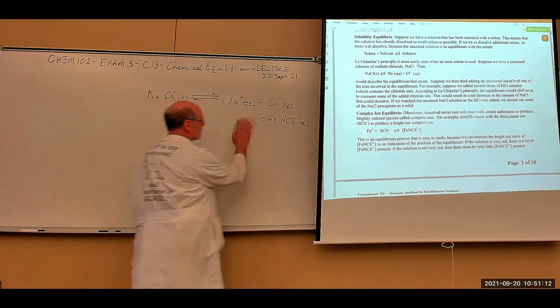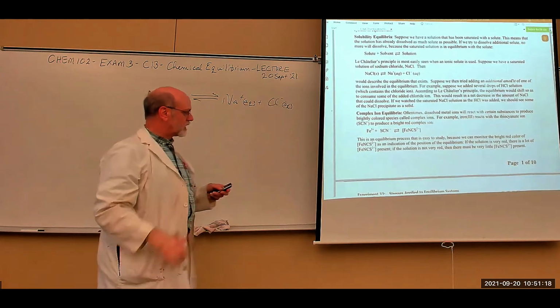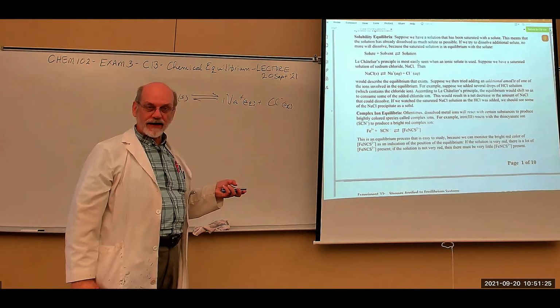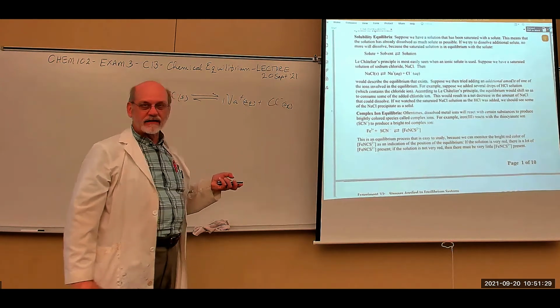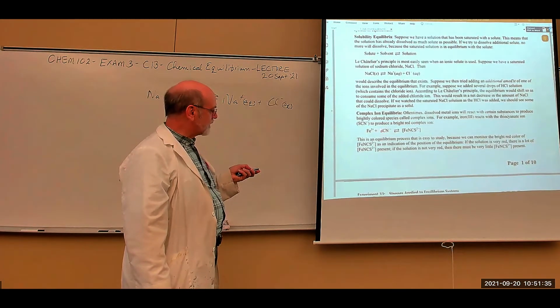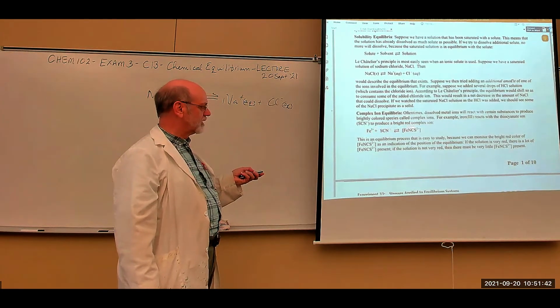What's another possible equilibrium? I mentioned it earlier: iron and the thiocyanate. We're going to have to form the iron thiocyanate complex first. So we'll add iron 3 chloride to potassium thiocyanate, and that gets the thiocyanate and the iron 3 plus ion together.